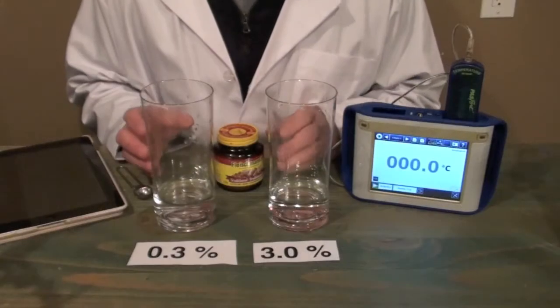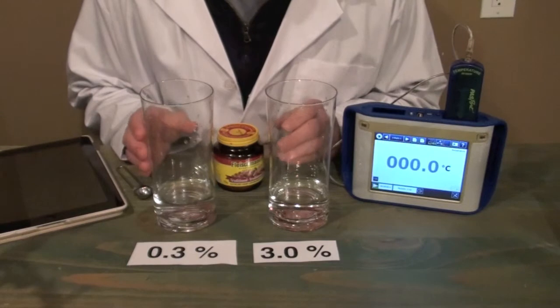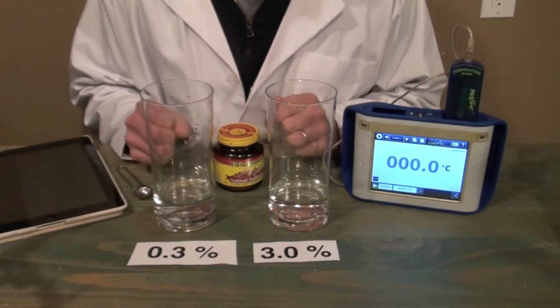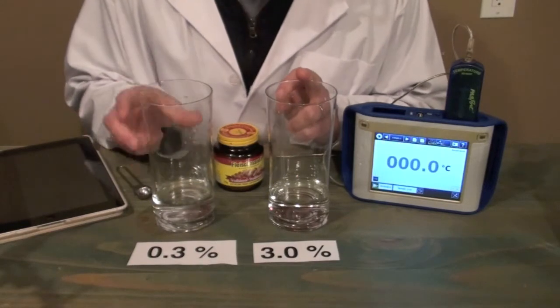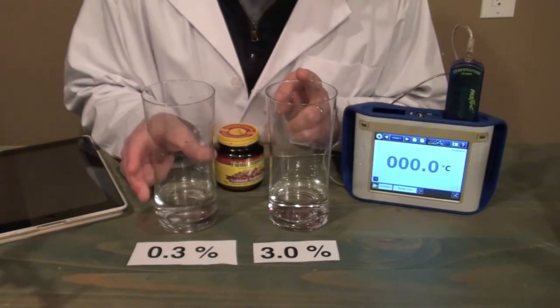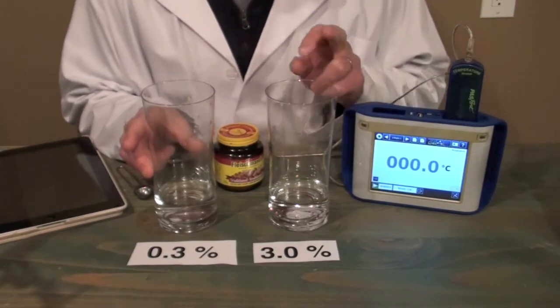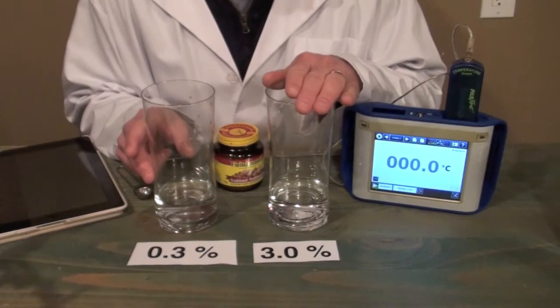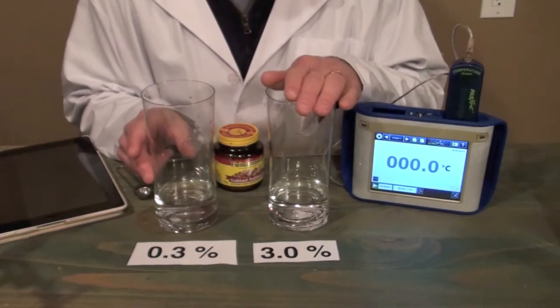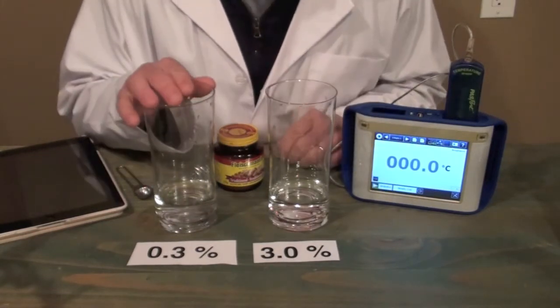In this experiment, we're going to investigate the effect of concentration on a decomposition reaction. Specifically, we have two different concentrations of hydrogen peroxide. In one container, I have 0.3% hydrogen peroxide. In the second container, I have 3% hydrogen peroxide. So this second container has 10 times the concentration of the first container.